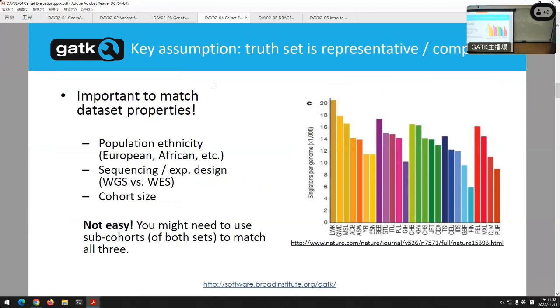Also, the statistics you see depend on exactly what kind of sequencing you did. If you're just doing exome sequencing, that's going to look different than whole genome. Partly, you see different distributions in depth. You see different error rates around the edge of those distributions. It's going to look different. Not to mention that when you're only looking at specifically protein-coding regions, the amount of mutations in those regions can be different than looking at other parts of your genome. Some regions are more conserved than others, as you well understand. Also, again, when talking statistics, you should probably try to keep the cohort size reasonable. Certain statistics shift a bit if you're calling 10 people versus 10,000.